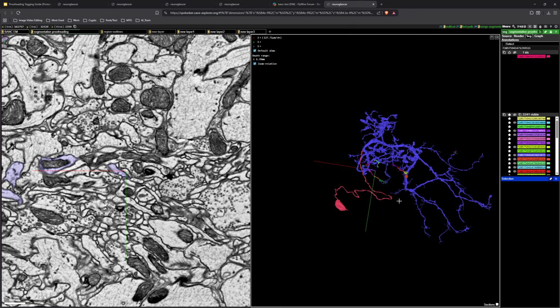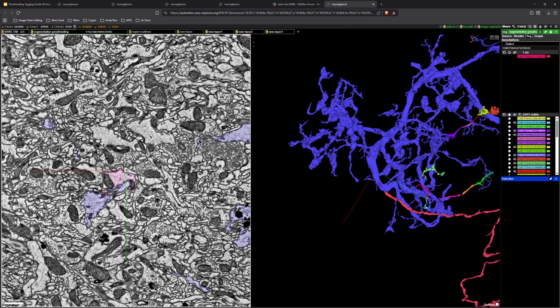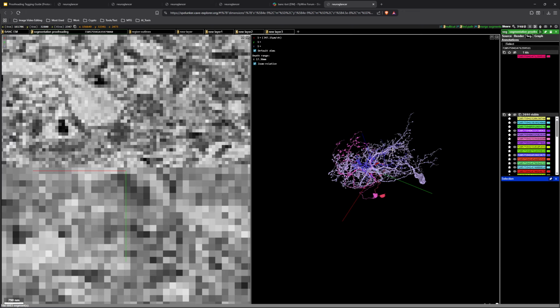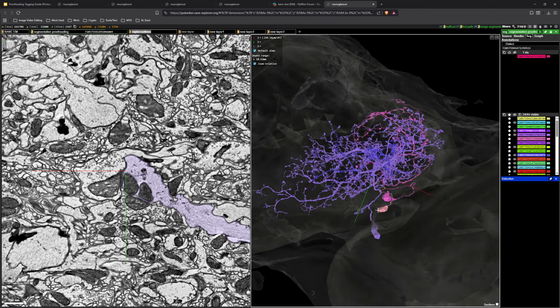So this is another one where it helps to click around and see what else is going on around this. So that's the main strategy. So let's just get some friends here. And as you can see, of these three we selected, this one is probably not going to be helpful. But the other two are starting to help paint the picture of what we should expect from this cell. They're pretty central to here. They're not spanning multiple regions per se.